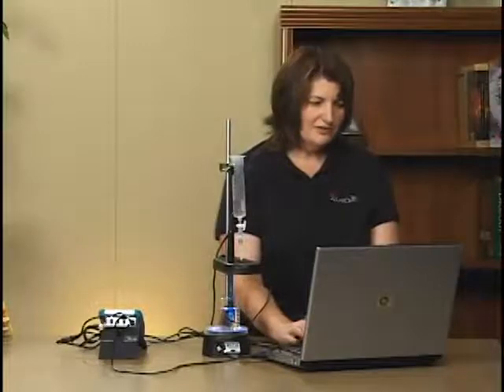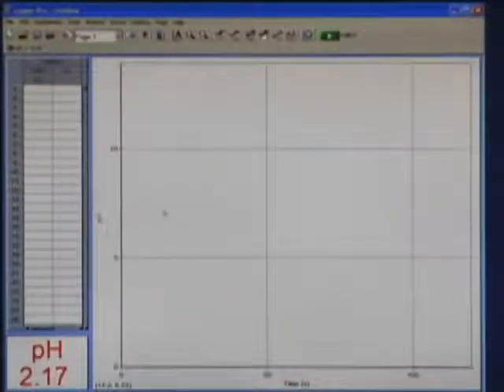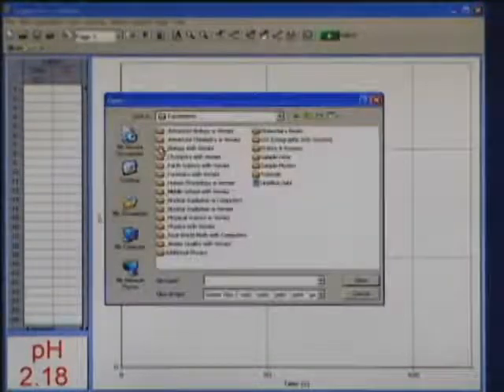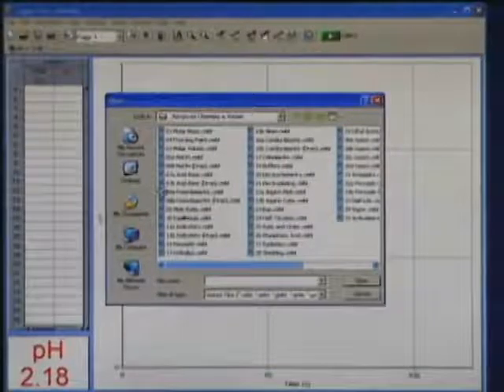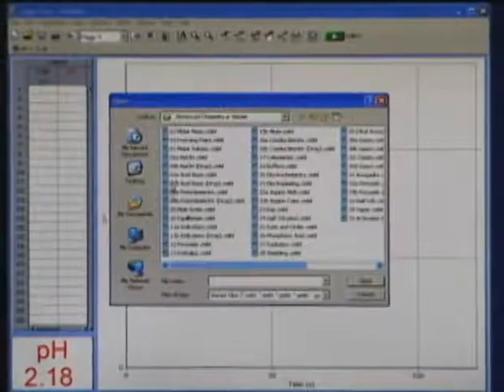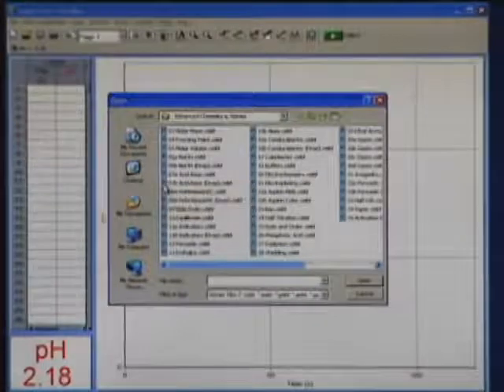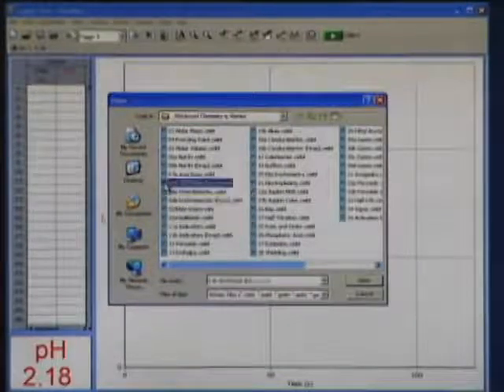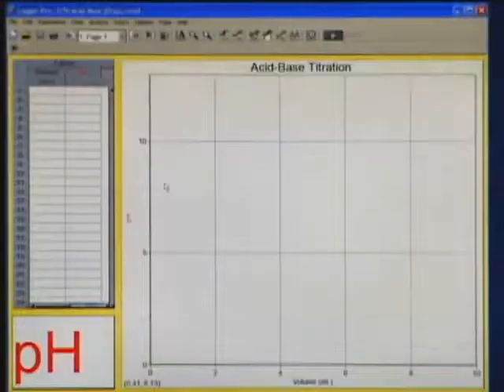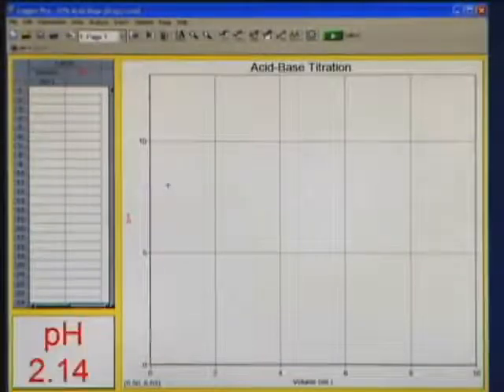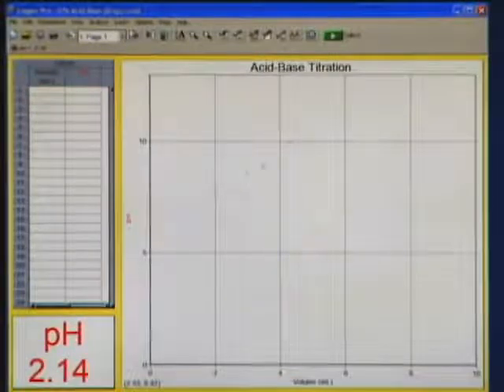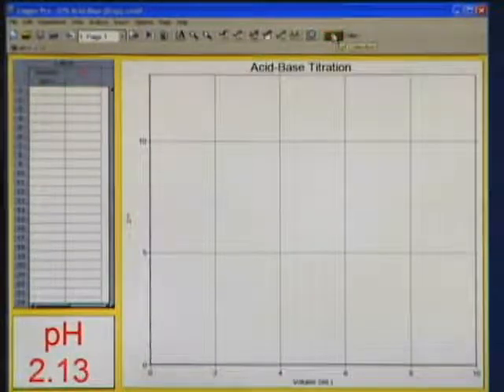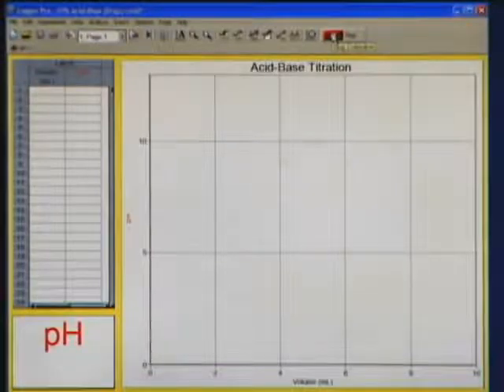So on the computer in Logger Pro, I'm going to open an experiment file from the Advanced Chemistry lab book. In the Advanced Chemistry with Vernier folder, I'll open up lab number seven. There's A and B. A is with a burette and B is with the drop counter, and we're using the drop counter, so I'll open 7B. I'm all ready to go. I just need to click on collect, and now it's waiting for me to start dropping the drops through the drop counter.